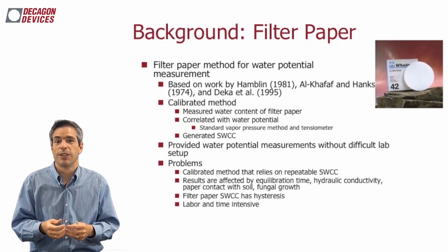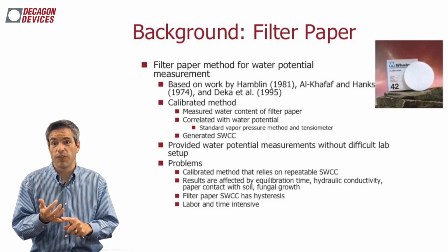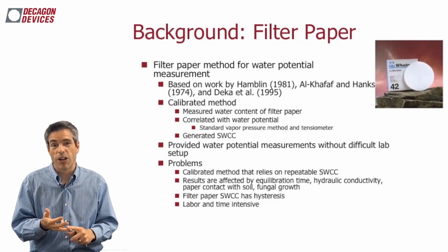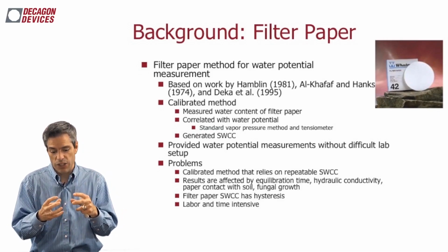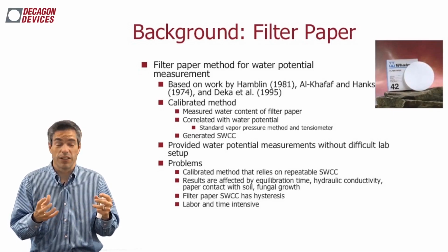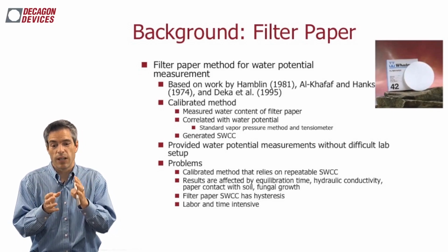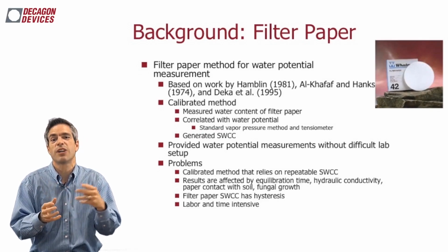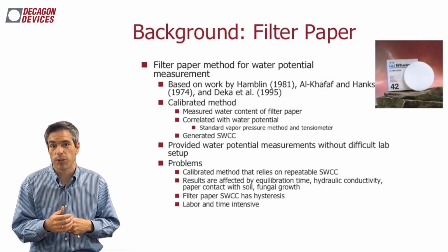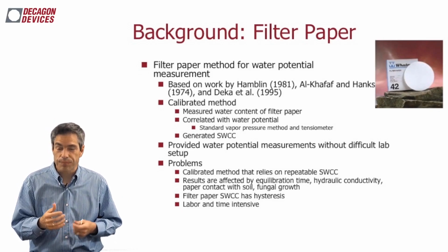There were other problems. Equilibrium time takes 7 days at least, if it's even equilibrated at all. Hydraulic conductivity, when you put it in contact with the soil, are we in equilibrium? And even some of the techniques these days include putting a filter paper across a membrane with the soil on the other side and waiting for vapor equilibrium. That's even more dangerous and difficult to do.